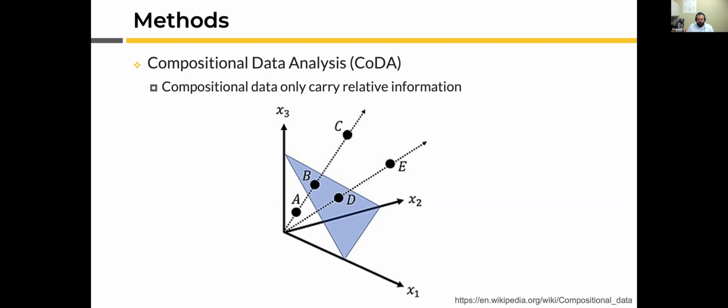So really, when you have microbiome data, this kind of sampling data, what you really have is relative data. For example, you'll notice all of the comparisons that we've been doing are between groups, right? So we aren't looking directly at, well, the beta diversity does do pairwise comparisons, but we're not making statements about the absolute abundance of any particular organism, mainly because of this issue.